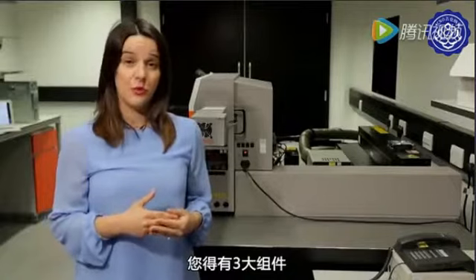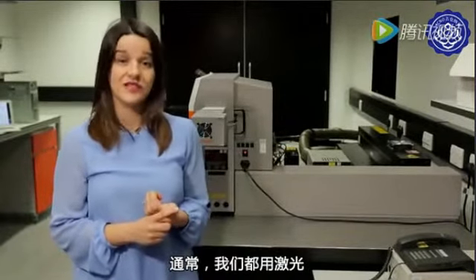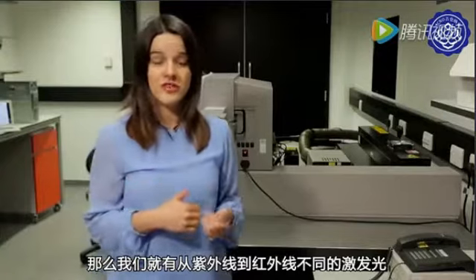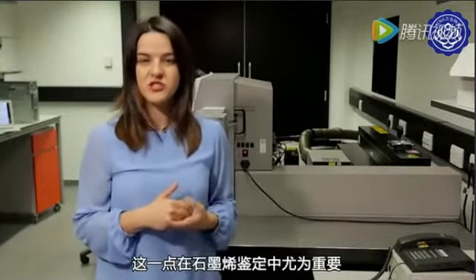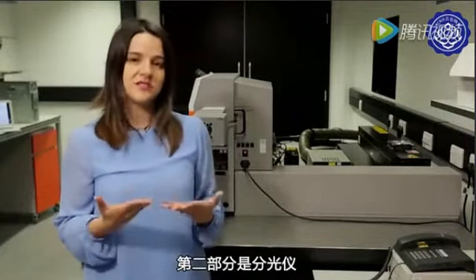When you want to do a Raman experiment, you need three components. First of all, you need a source of light, so typically you use a laser. Here we have 4 lasers, with different excitation lines from UV to infrared. This allows us to do multi-wavelength Raman spectroscopy, which is extremely important in characterizing graphene and in general any carbon nanostructure. The second component is the spectrometer.